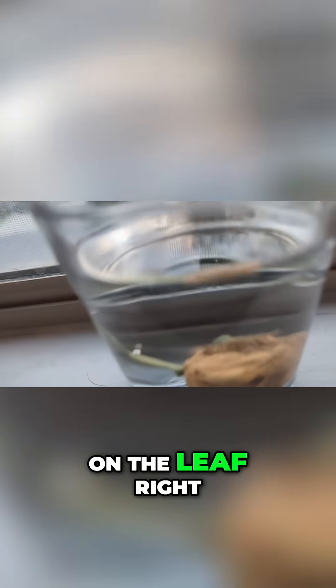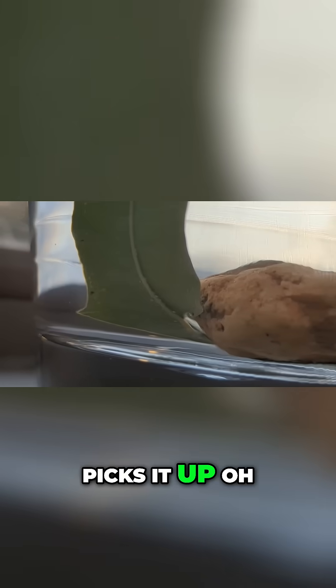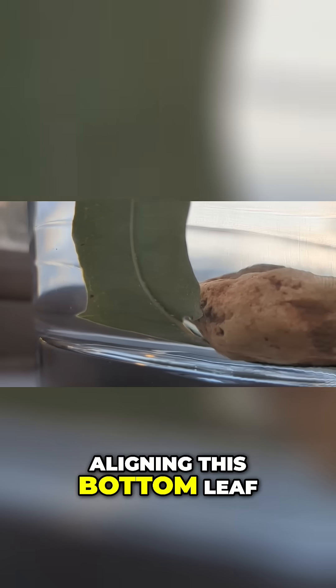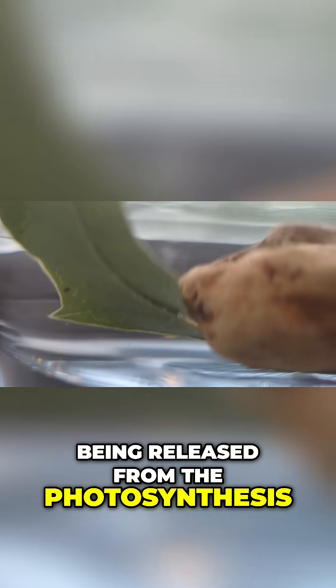Oh yeah, huge one on the leaf right there, but it's so hard to see — I doubt the camera picks it up. Oh, you can kind of see it. Yeah, you see all these bubbles aligning on this bottom leaf right here, especially down right there. That is the oxygen being released from the photosynthesis.